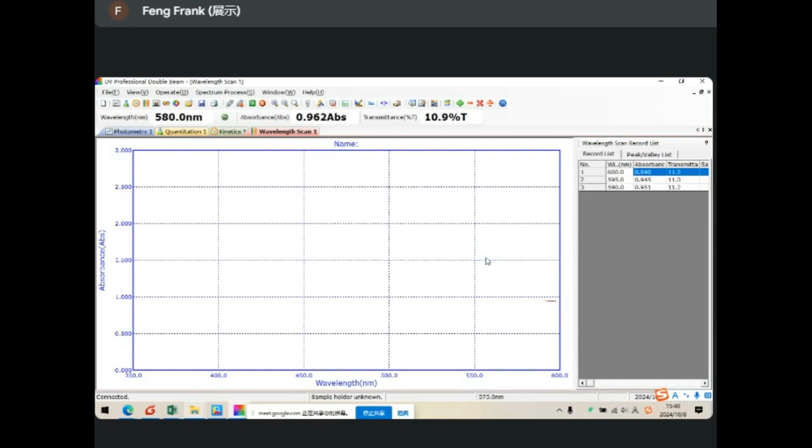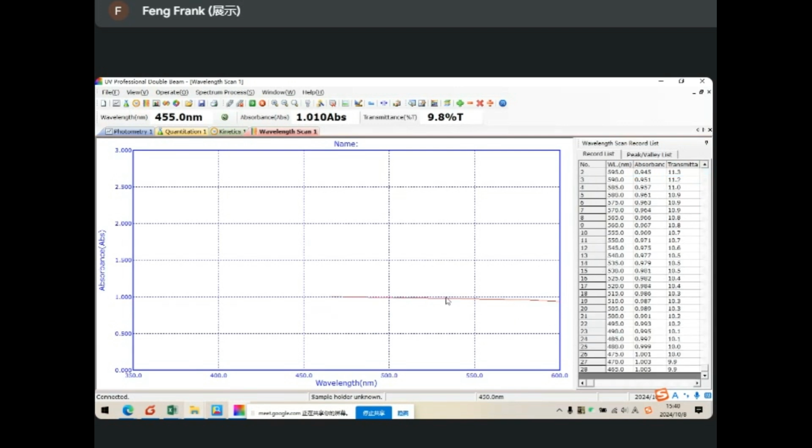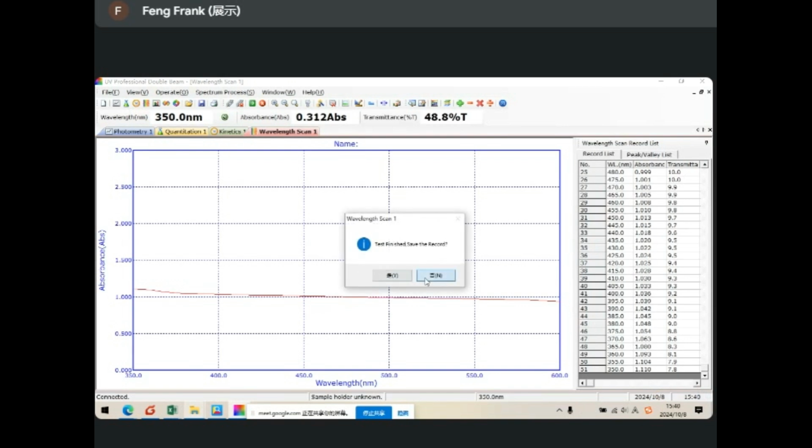And you can do some other functions like search the peak and valley. Here, you must set up the threshold first, in the peak value setup, like this. Then press OK. Then you can select its peaks. Because there is no peak, there is no value here.